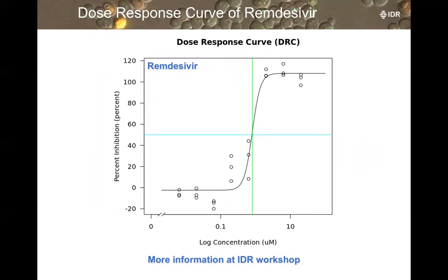This notebook can be used to calculate the IC50 value and plot the dose response curve of other compounds in the screen. You'll have an opportunity to explore this notebook in more detail during the IDR workshop.